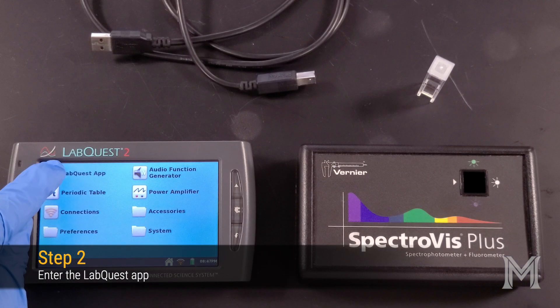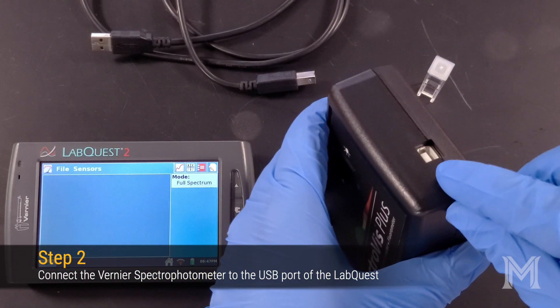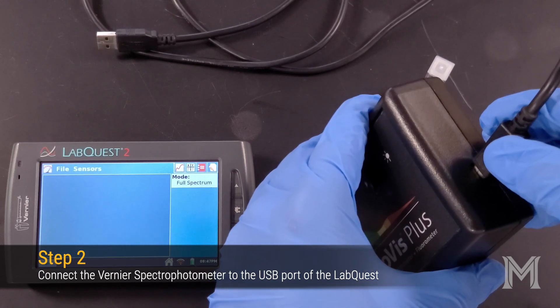Next, enter the LabQuest app by clicking on the icon on the LabQuest home screen. Use the provided USB cable to connect the spectrophotometer to your LabQuest.